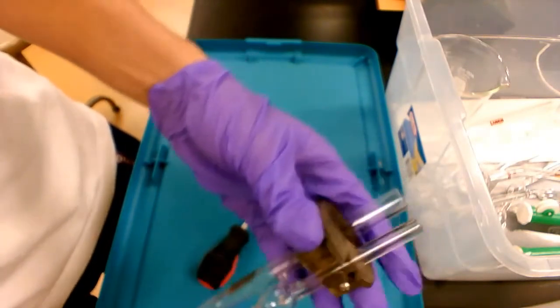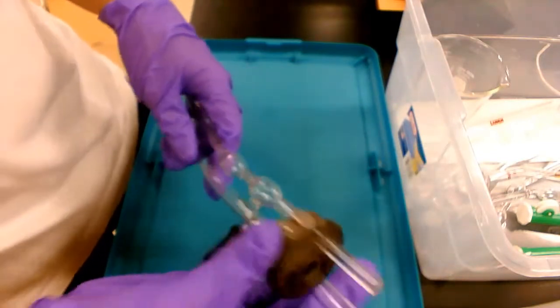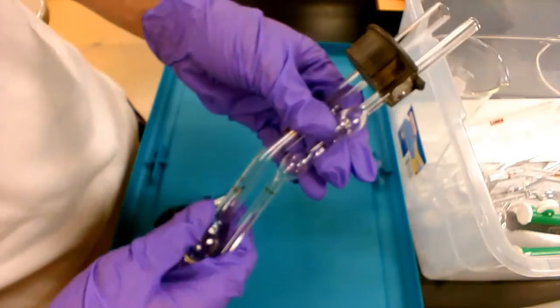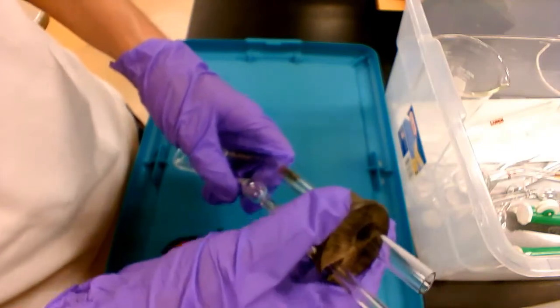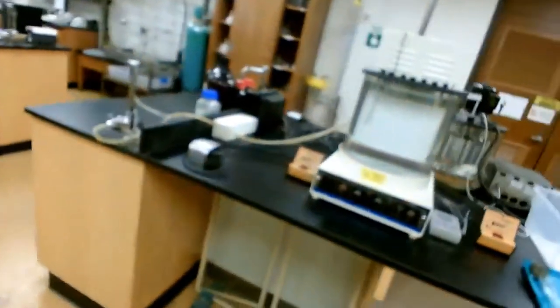So right now it looks very good. Another thing to keep in mind is that when holding the entire assembly, hold it tightly rather than just at the top of the holder — otherwise you risk dropping it. The next step to perform this experiment is to turn on the water bath.